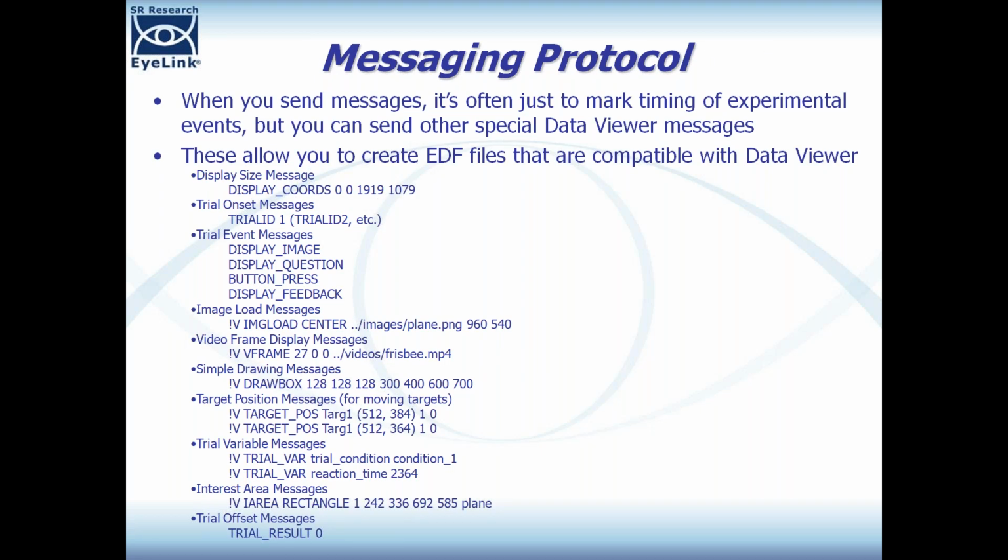Okay, so the messaging protocol. This is the big topic of today. As I mentioned, when you send these messages, it's often used to mark experimental events, but you can send these other special Data Viewer messages. And these allow you to create EDF files that are compatible with the Data Viewer software. We're going to go through each of these in detail, but I listed the different ones we're going to talk about here.